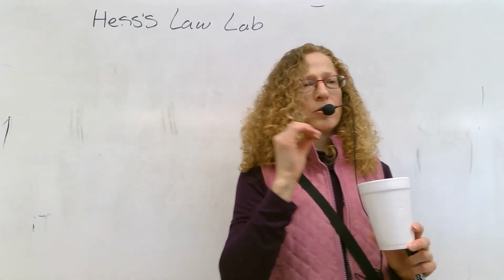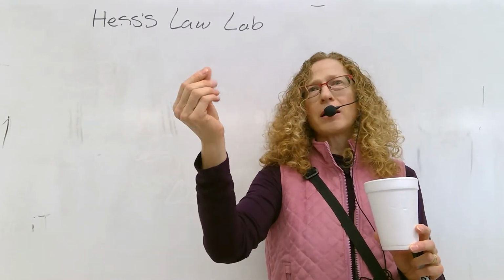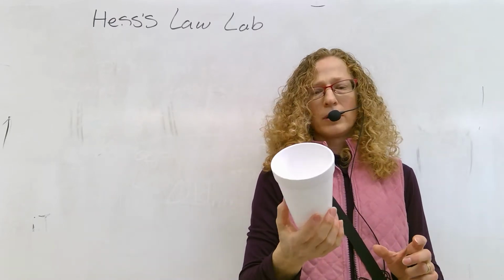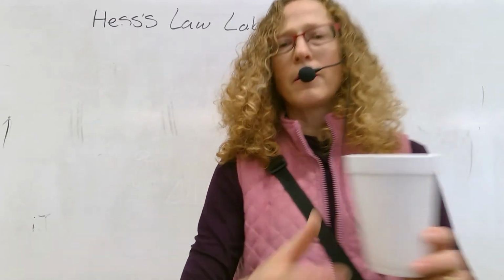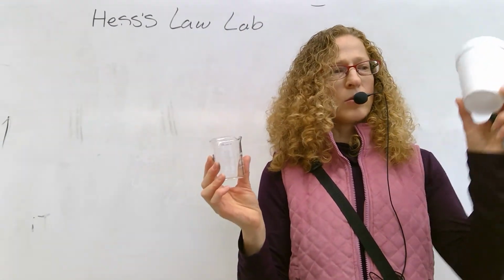It's real important today to use your goggles and not touch your eyes. Because if you have base, even if you try to wash it off, it's not going to all come off, and so if you touch your eyes, you don't want to do that. So you have the mass of this. You get some KOH in here. You put some water in here.